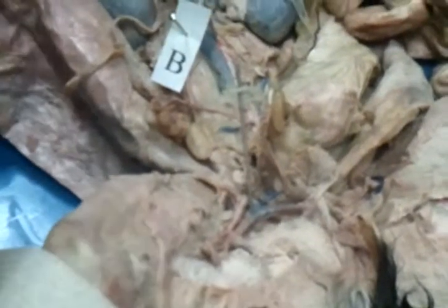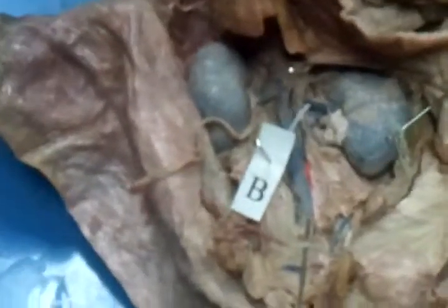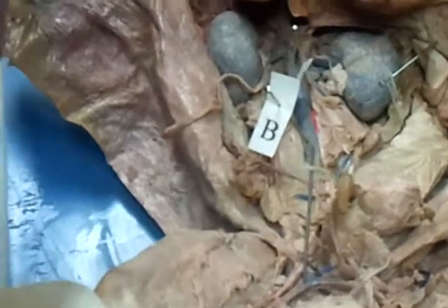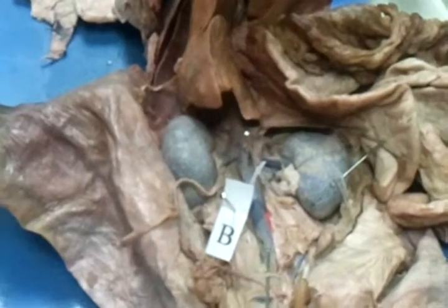Okay, so you have the vein, and of course associated with the vein is always an artery. It's the exact same, still the iliac artery. Okay, so if I do an aorta, it's going to look like this. And if you see a red vessel that I've cut open and it's sitting right by that big blue thing, because they're always right next to each other, you should know that's the aorta. That's the big artery that carries all the blood to your lower body from your heart. Okay, so why do you think the walls of the arteries are a little bit thicker? More pressure.